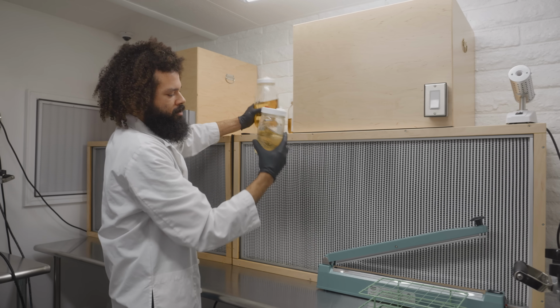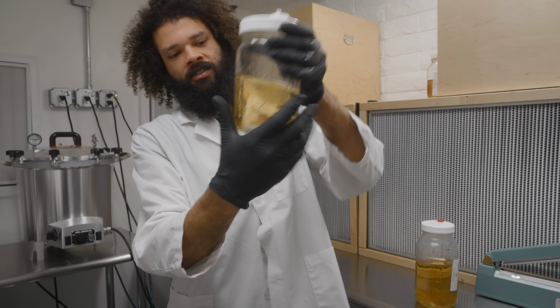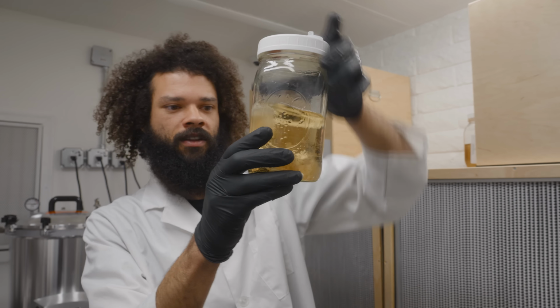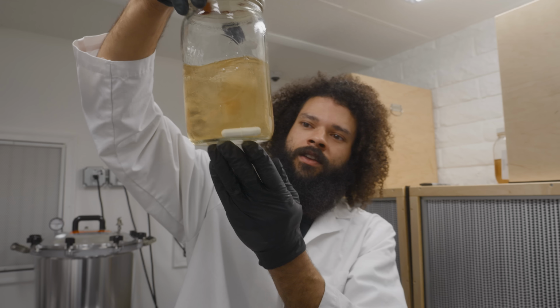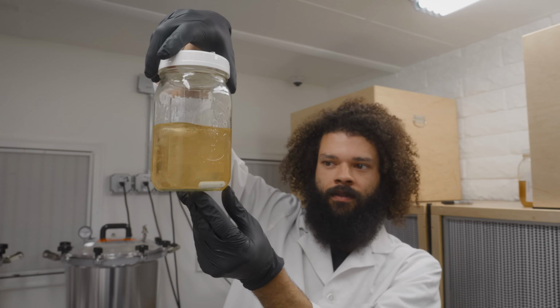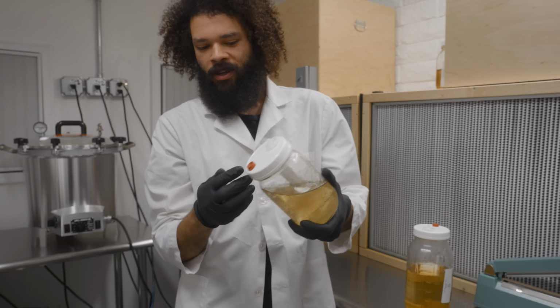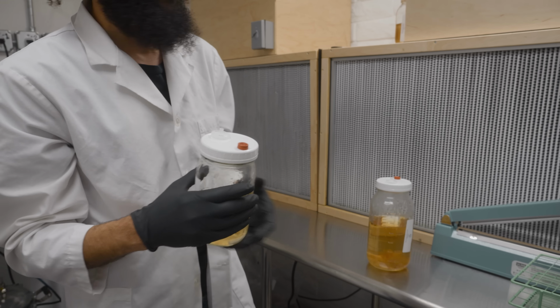We have some liquid culture that we just inoculated also with the agar wedges. So you can see the mycelium growing through the liquid. This is just about 4 or 5 days old at this point. And we could use the magnetic stir bar in there to agitate the liquid, or we could even just swirl it around like this. You can see the mycelium is developing really well throughout the media broth. We'll be able to extract this in just a few days. So we just extract the liquid through the injection port, and you can use that to also inoculate your sterile grain.